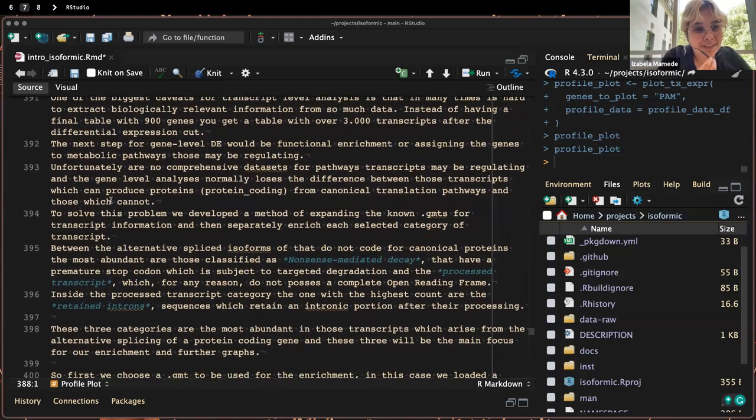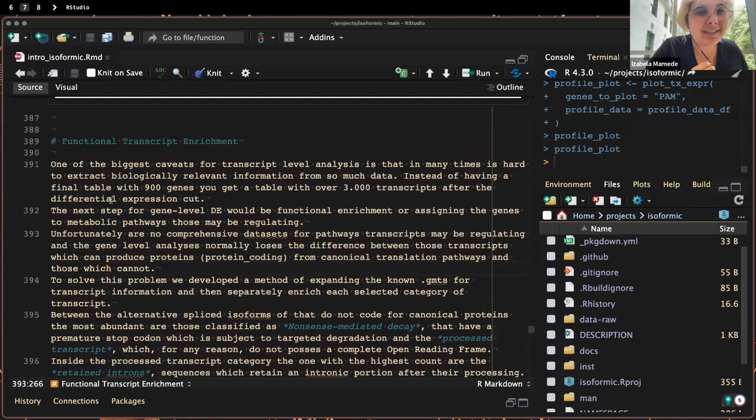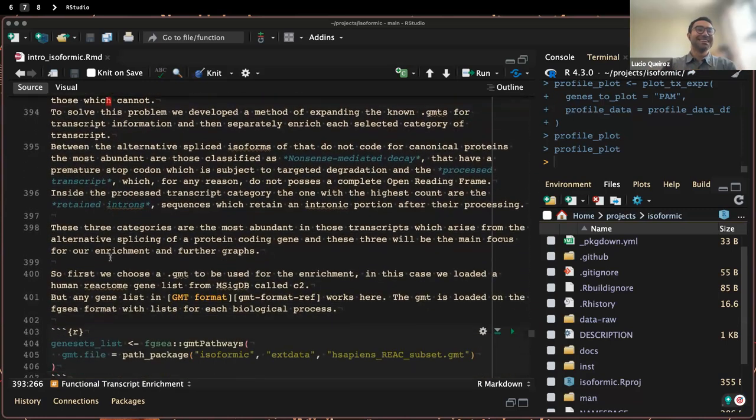Since it's a preeclampsia data set, it's going to have a lot of things related to cancer. Oh yeah, exactly. Preeclampsia is a disease that shares a lot of the processes. What they say is that the placentation is like a controlled cancer. Yeah, it's exactly what they say. Exactly. Placentation is a controlled cancer.